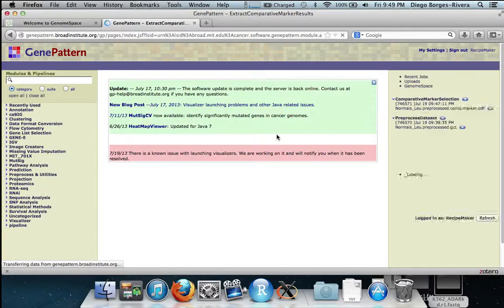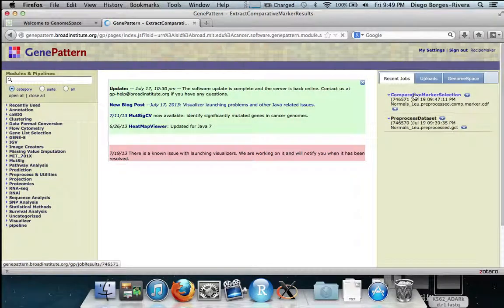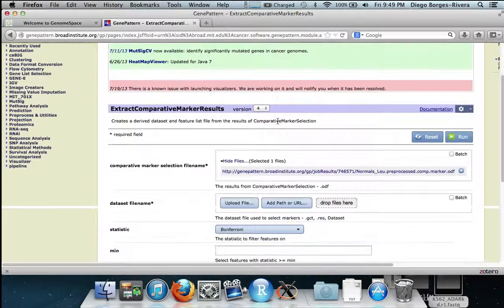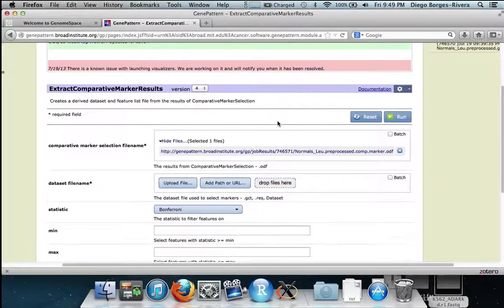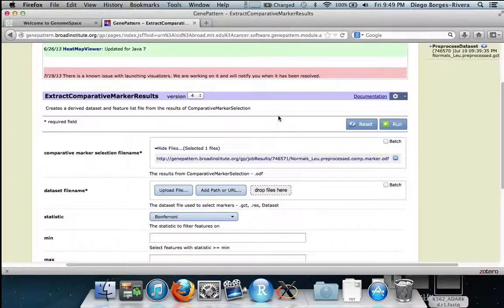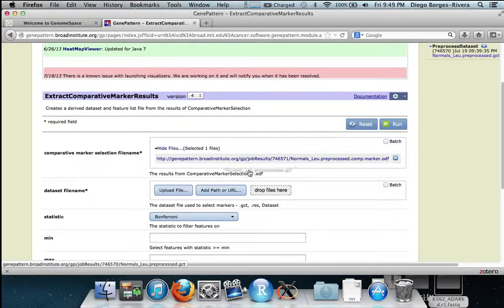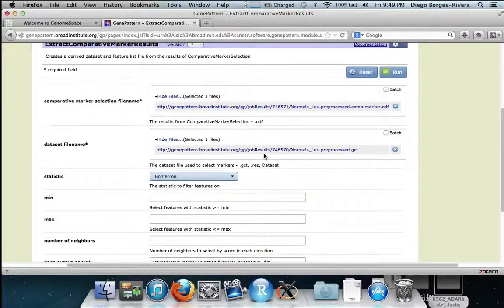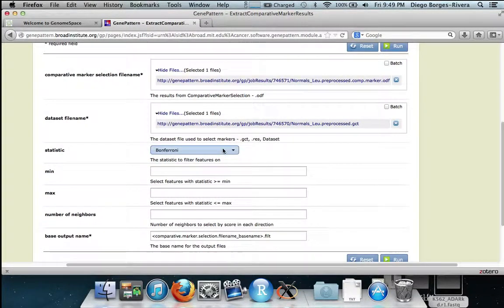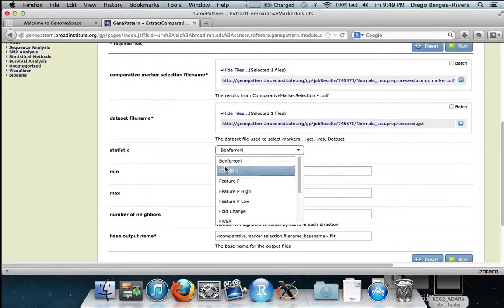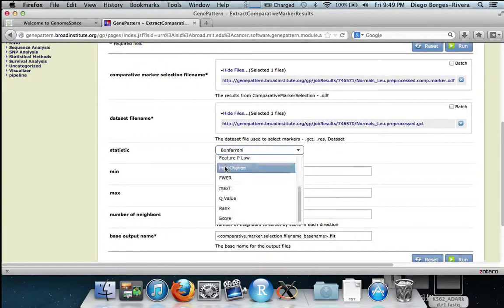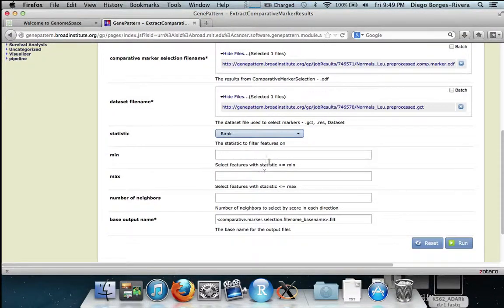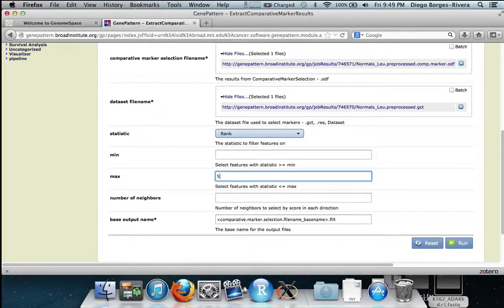We now want to select the top 50 genes as defined by rank. We do this by first taking the filtered expression file from pre-processed data set from job results and dragging and dropping, and then selecting rank from statistic and sending the max to 50. This will give us the top 50 genes. We then hit run.